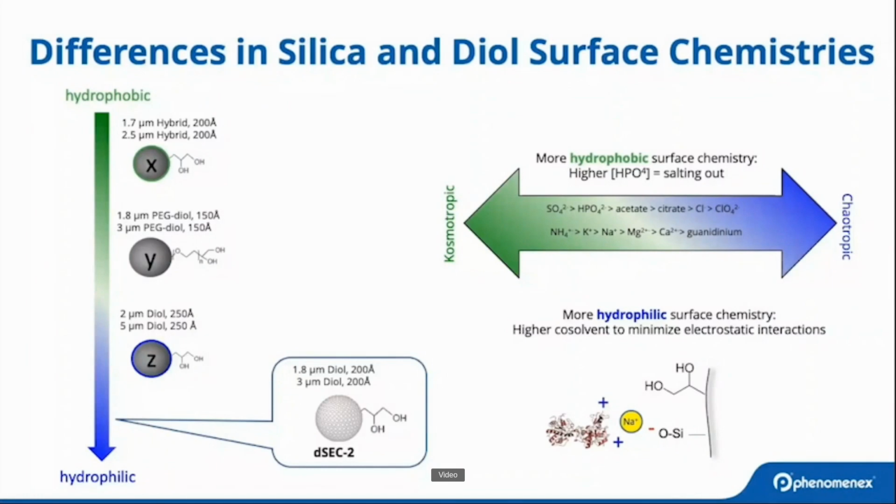In addition to mechanical strength, another crucial element for a size exclusion particle is the stationary phases used for bonding. And even the silica itself, especially a hybrid-based particle, may impact the overall hydrophobicity index of the particle. Additionally, every column vendor varies slightly in the diol used, whether in bonding density or the actual silane used for bonding. Even subtle changes in % carbon load can lead to increases in hydrophobicity.